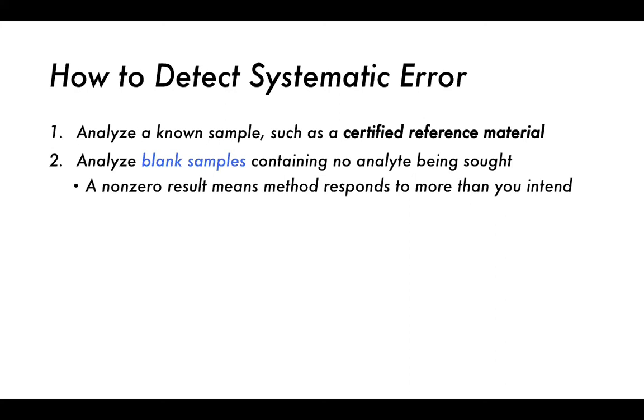So typically you see this in things like UV vis spectrometers, where even blank samples, because of light leakage into the container or into the sample holder area, sometimes there is a background signal. And so we need to know what that background signal is before we can actually measure our sample. And so usually there are ways and means of mitigating that already built into the instruments.